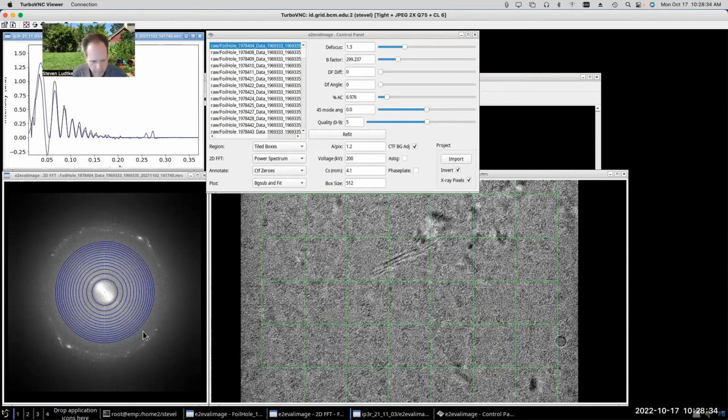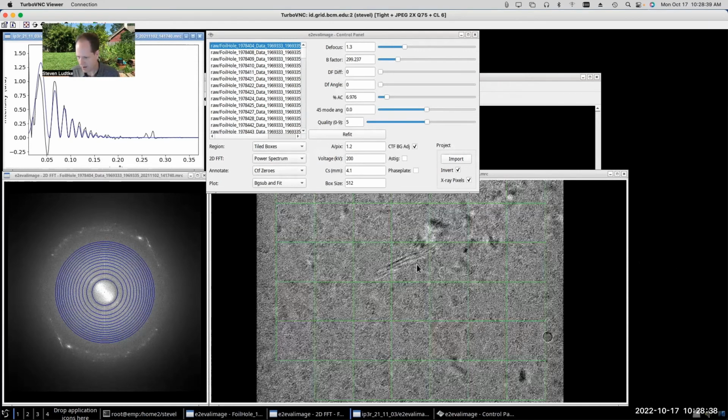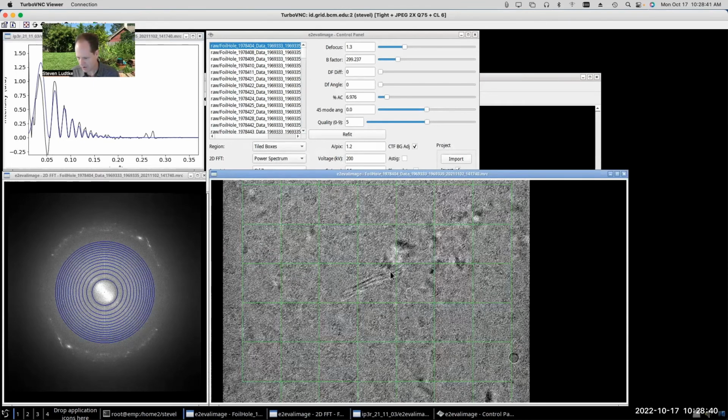All right. Now, taking a look at this image, you can say it looks kind of ugly. There's a bunch of stuff in here; those are particles floating around in the ice. This is actually IP3 receptor data, so Arena's lab should be very familiar with this. This was test data that we collected as part of the CPRIT grant in our joint cores. These are individual particles floating around, and this is some sort of ice contamination floating around in here.